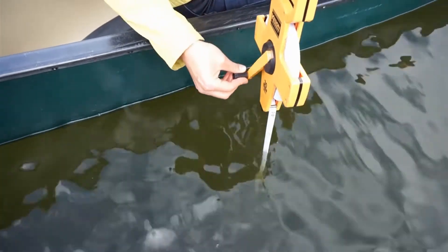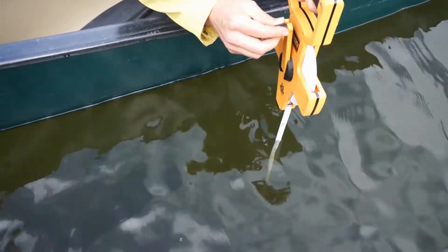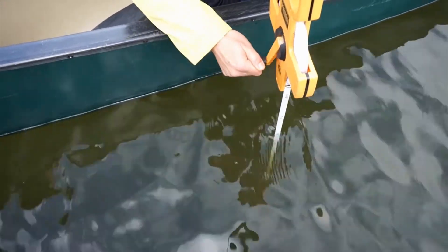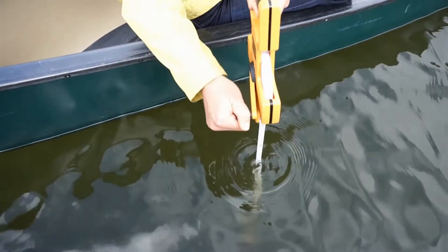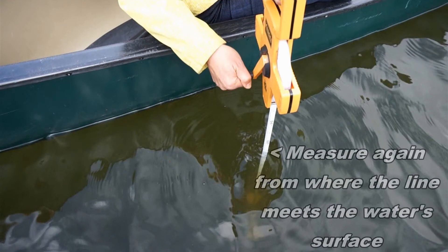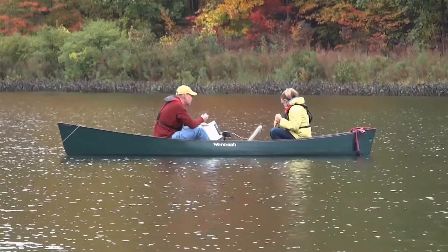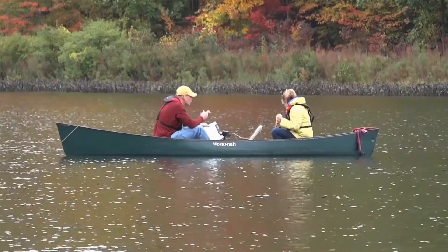Now take the disc down a little bit further. At this point you can't see it anymore, but we want to confirm that. Then we'll start bringing it back up slowly. When you can first see it again — when it first reappears — we'll record that depth as well. Those two measurements should be within a half a meter of each other. If they're not, you'll want to repeat those again.